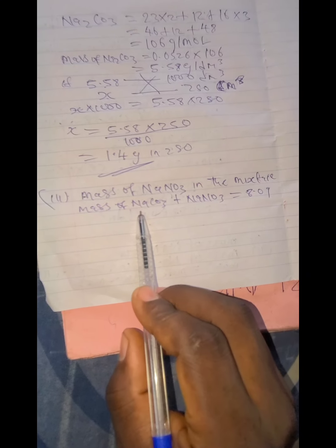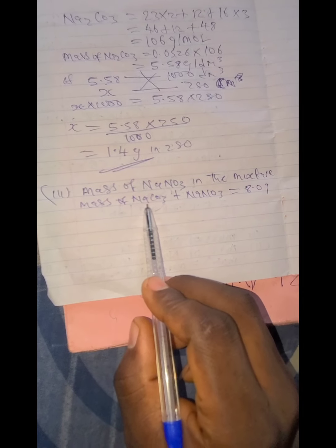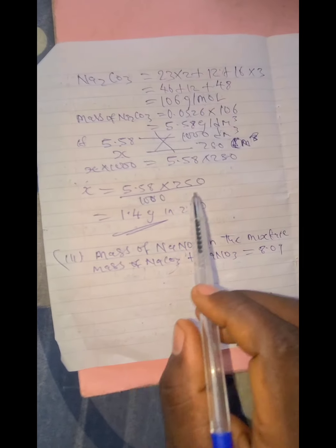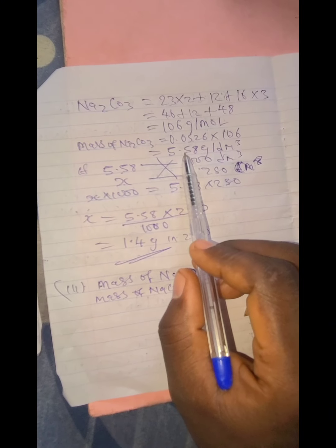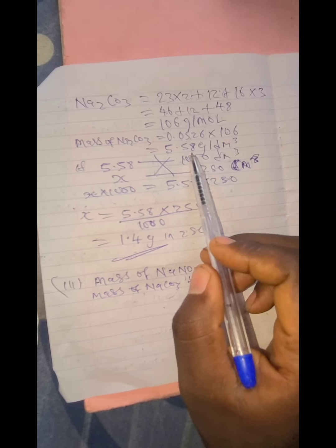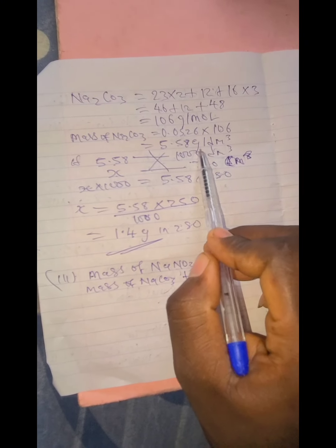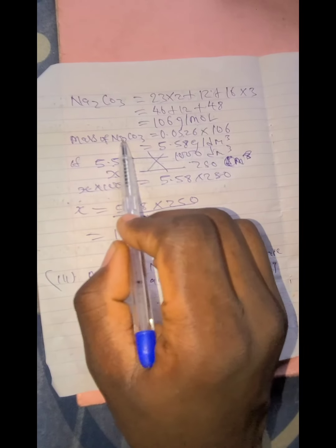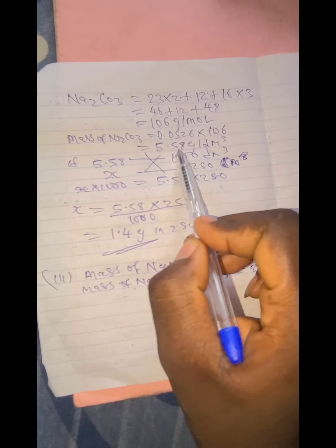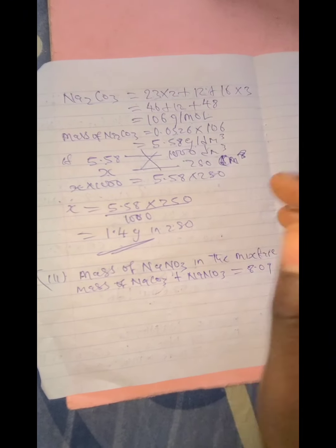Thank God we have solved for the mass of sodium trioxocarbonate. Come here. The mass of sodium trioxocarbonate, we solved it as 5.58 gram per dm cube. Yes, this is the mass. You see, the mass is 5.58 gram because it's in dm cube.